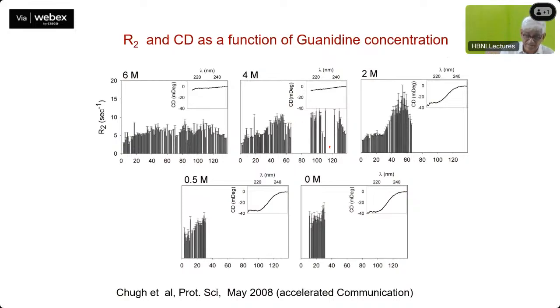And you see, at 0.5 molar this fellow still remains open. So in the assembly, the aggregated species also, this is still flexible. Now you see the helix is formed. Here also helix is formed. This going down here is an indication of the formation of the helix. And here the helix is almost completely formed. So this is the normal native state kind of pattern that you get here. And this portion and this portion are roughly the same, although this one had slightly more intensity.